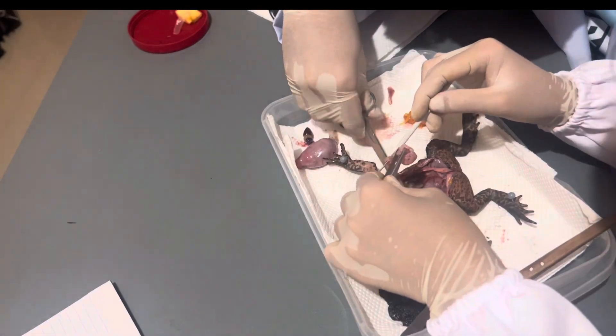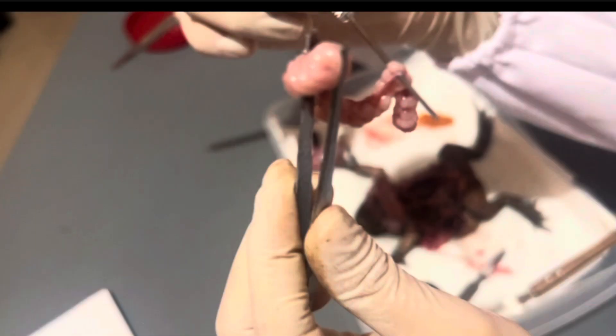These are the fat bodies of a toad. This is the largest body lipid deposit that is also interconnected with the gonad. Here we can also see the oviduct, which carries the eggs from the ovaries up to the cloaca.